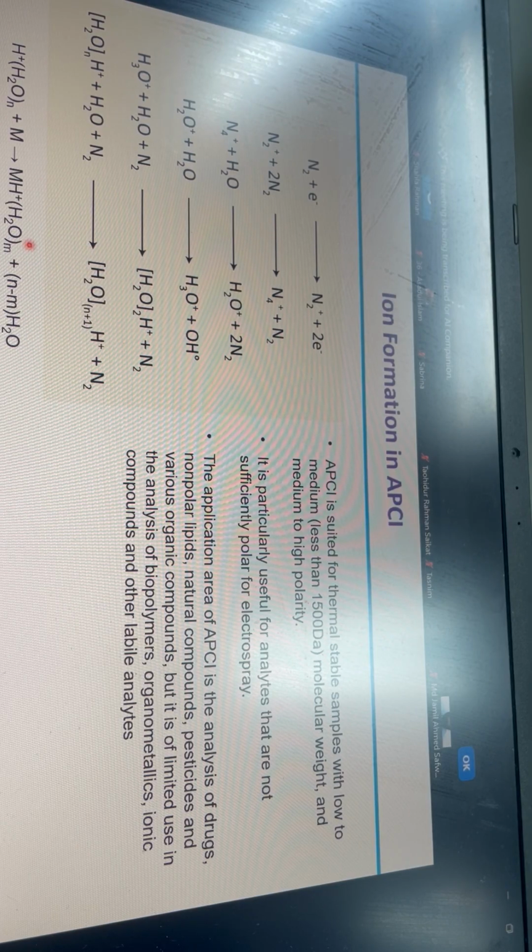You did, sir, the photodissociation. Sorry. You're using UV and IR photodissociation. Oh no, that's for fragmentation. Okay, so they use water solvent. Can we use any other type of volatile solvent? Alcohol. Yeah, alcohol means methanol or ethanol. Great. Yeah, that's what another guy did.